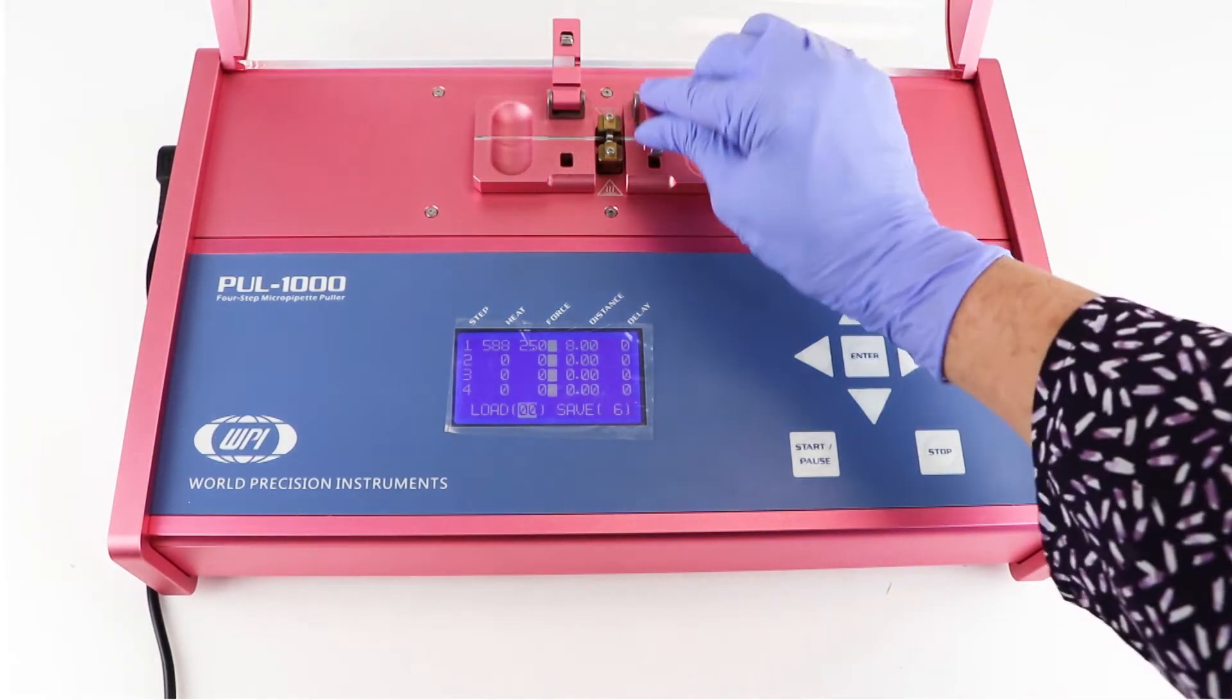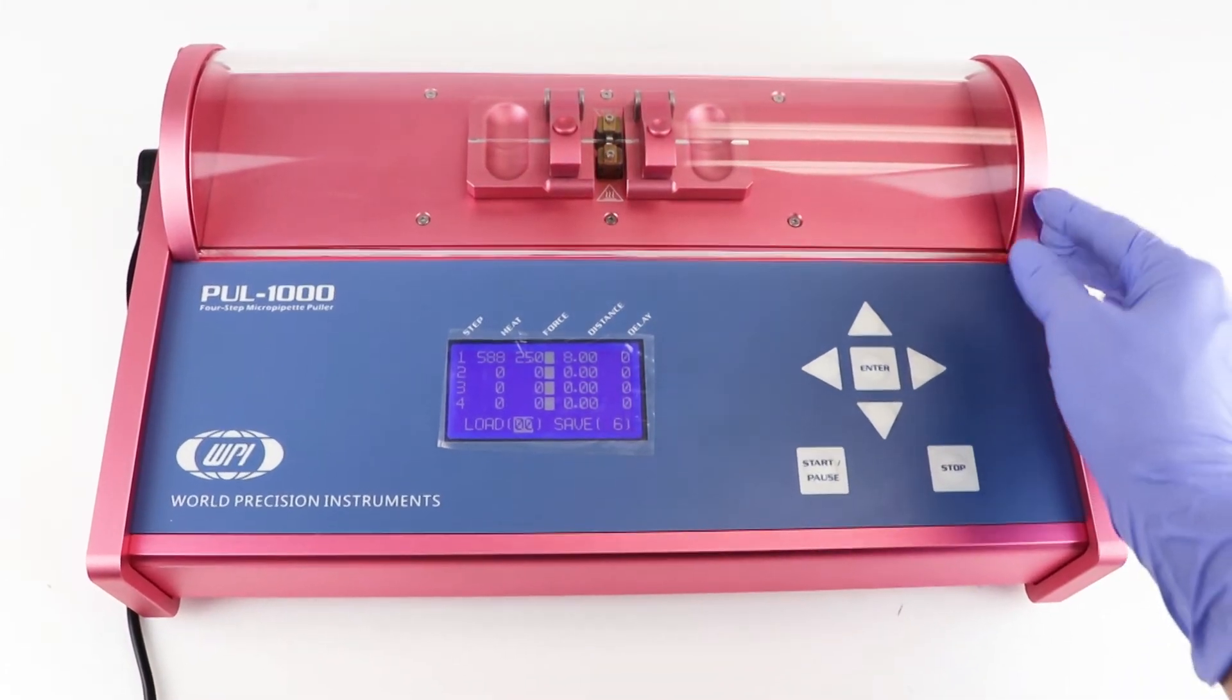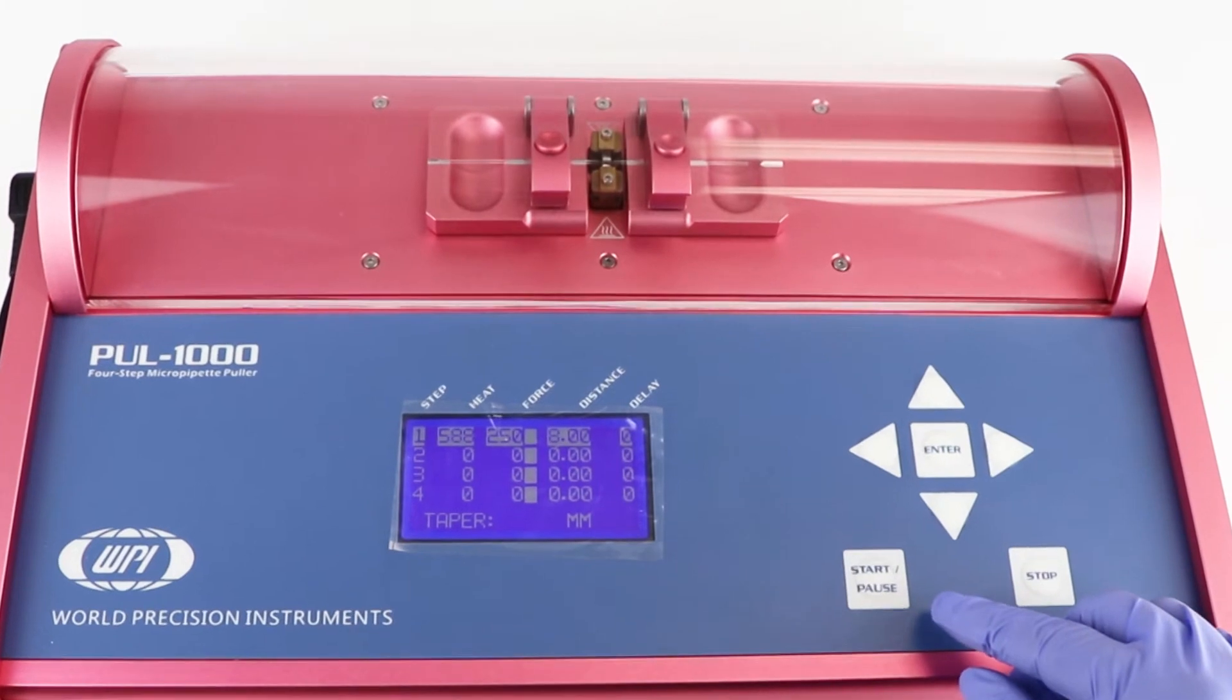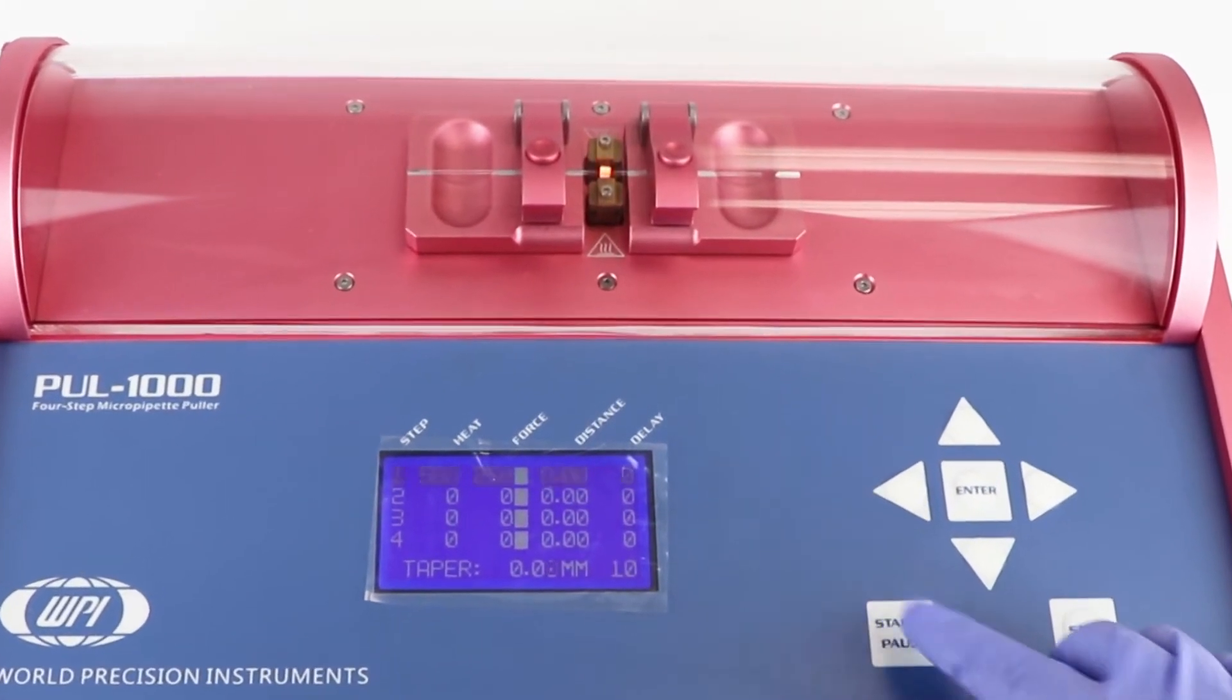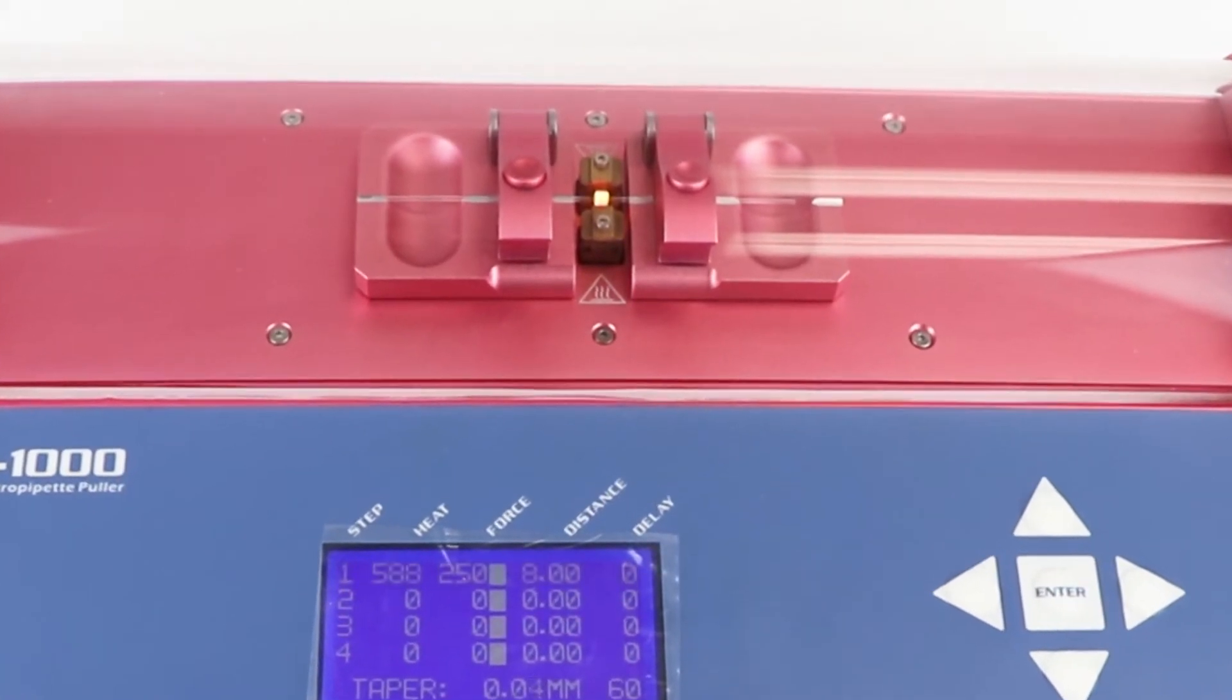The puller was designed with tight mechanical specifications and precision electronics for complete control of the pulling process and accurate reproducibility. It offers programmable sequences of up to four steps with heating, force, movement, and cooling time.